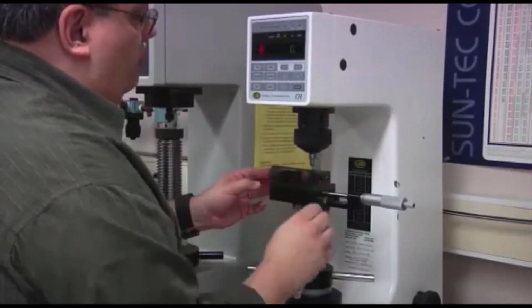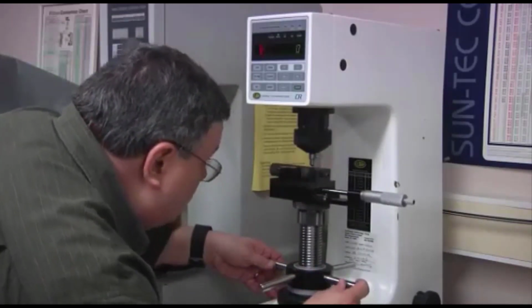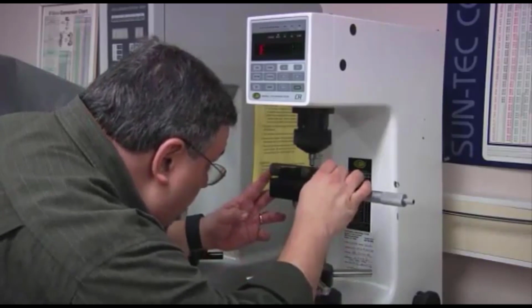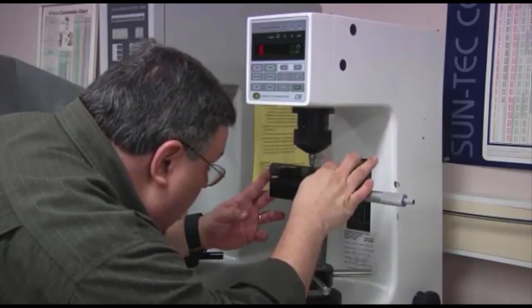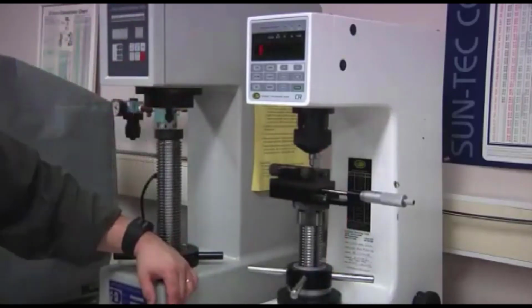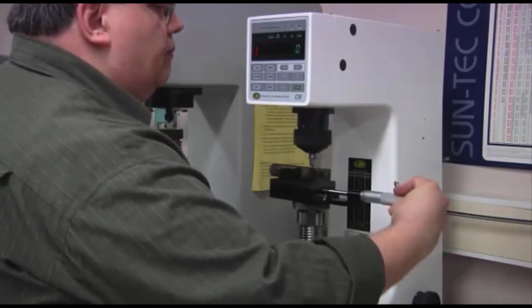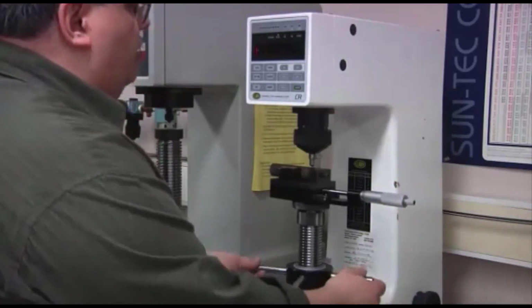I'm going to back this screw off a little bit, raise it up until the indenter is within a millimeter or so of the surface. And then I will use the indenter and its reflection, looking right along the end of the bar, to position the end of the bar to be exactly in line with the specimen. I've already set the micrometer back to 0, and so we're ready to begin. So I advance the micrometer 2 revolutions. 1, 2. That gets us to our first measurement point of 0.05 inches.